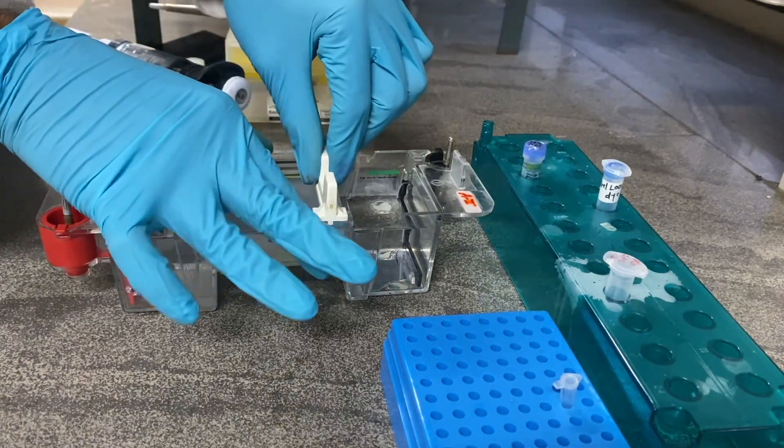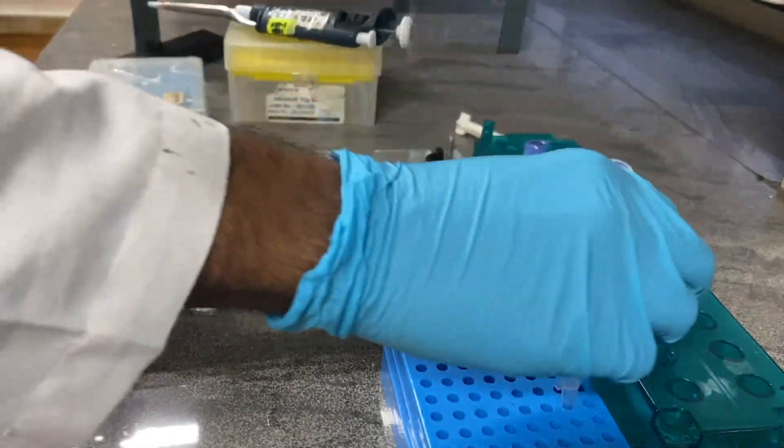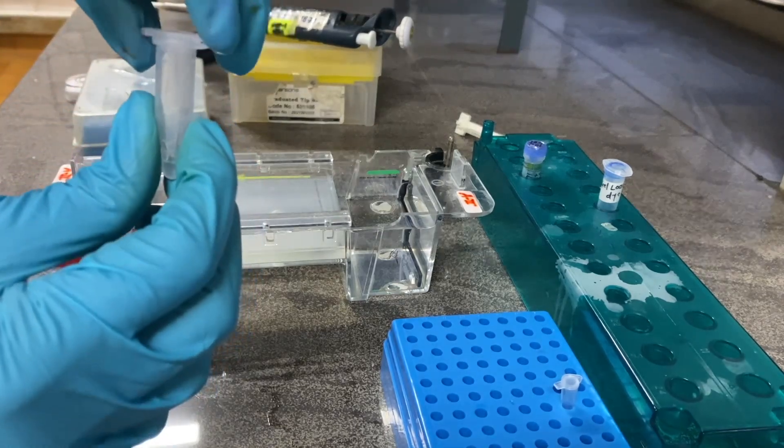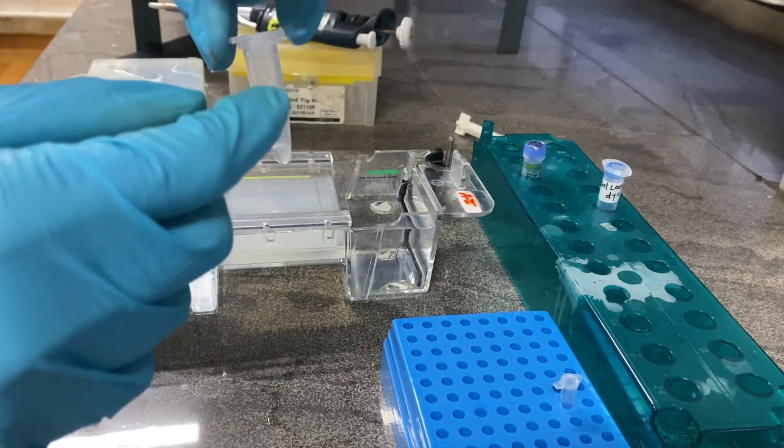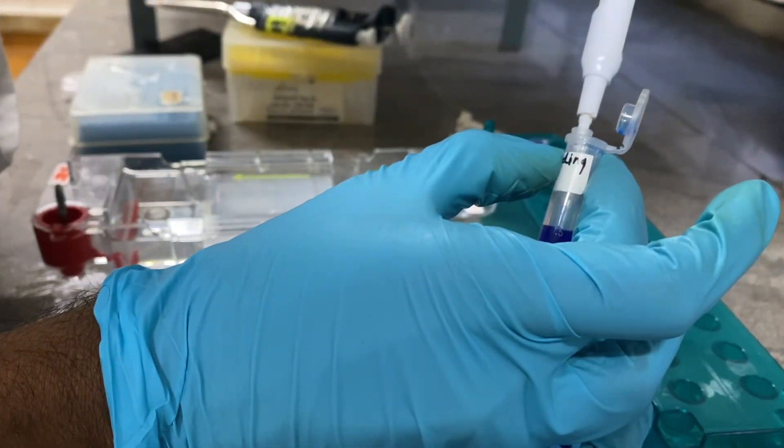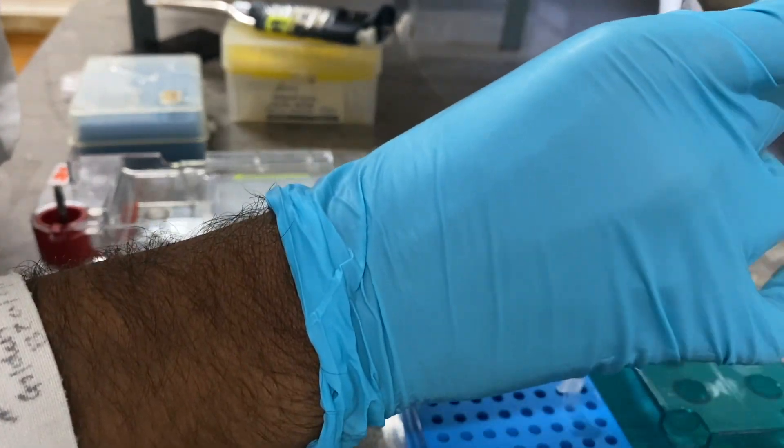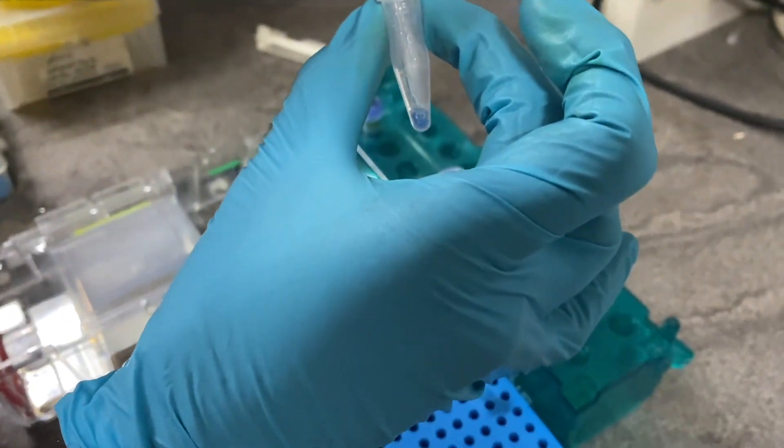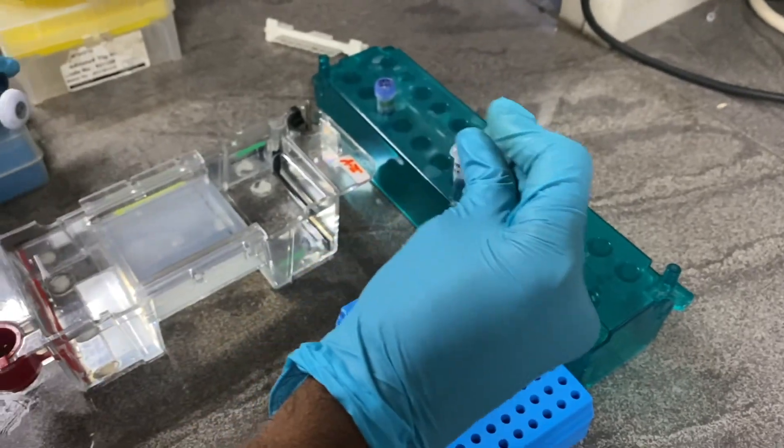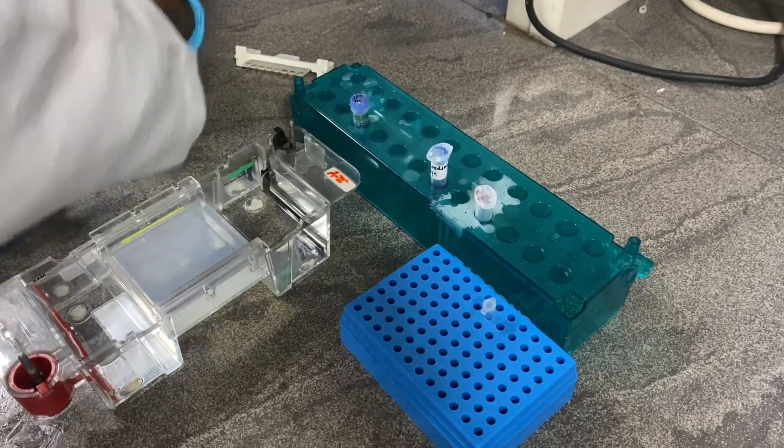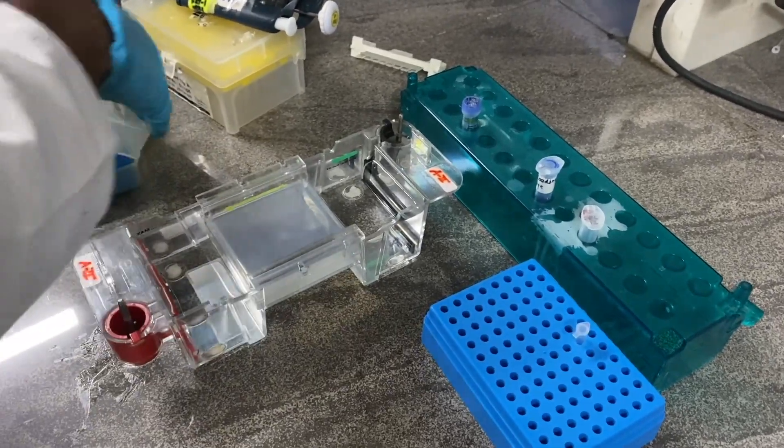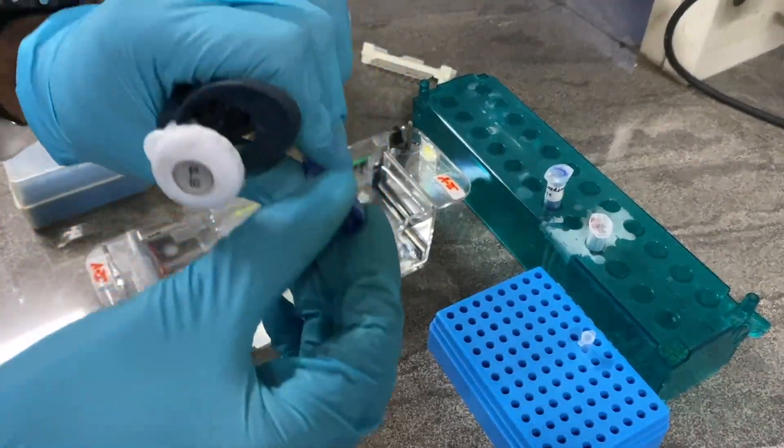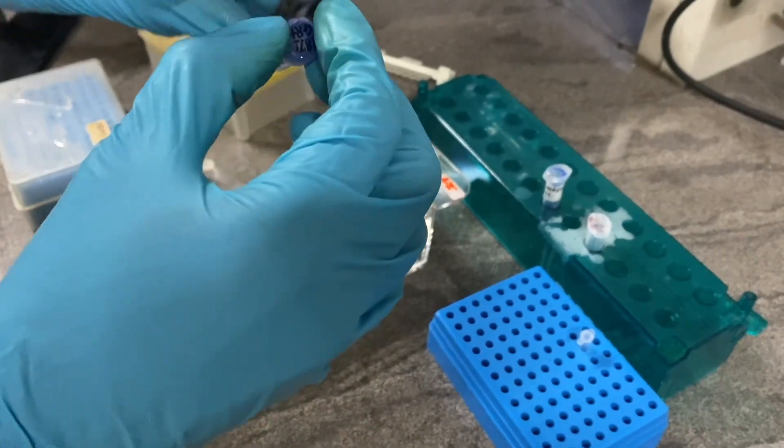I have prepared 1% gel. Now we will load our reaction. Some people may inactivate the restriction digestion reaction and today I am not going to inactivate the restriction digestion reaction. We will add the gel loading dye into it and I will load entire reaction. The preparation of gel is depending on your insert. If your insert is very small you can go for higher percent of gel. Here my insert is bigger so I have gone with a lower percent of gel.